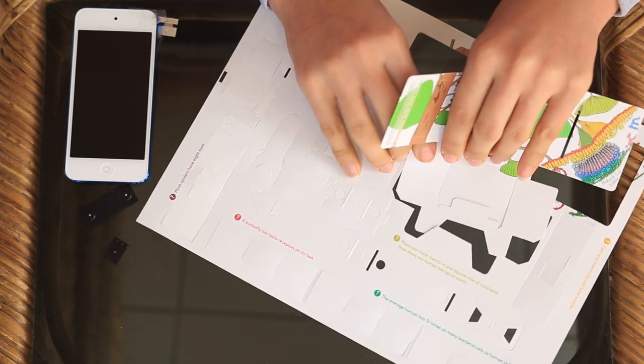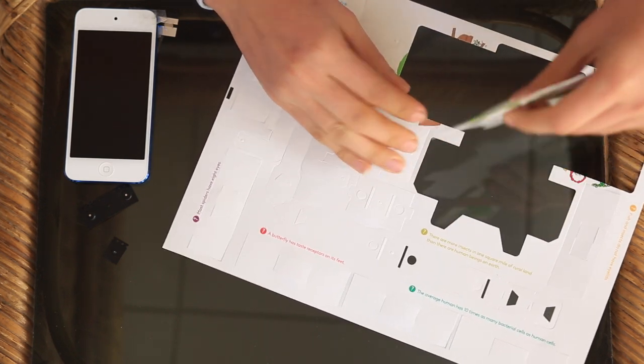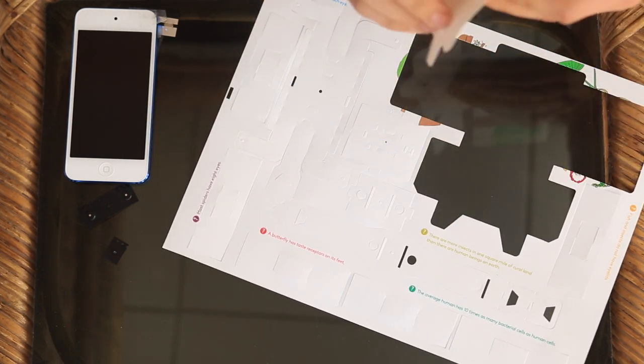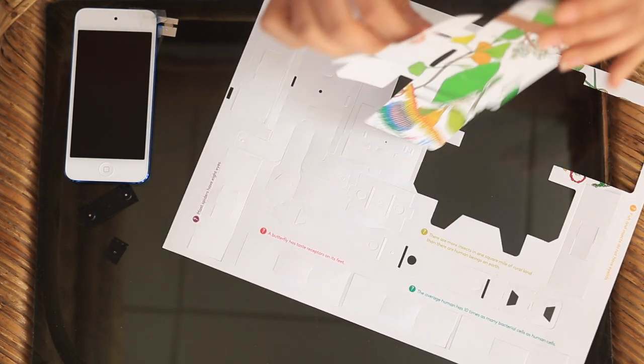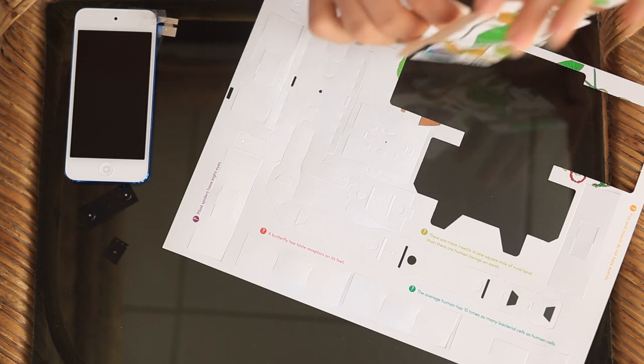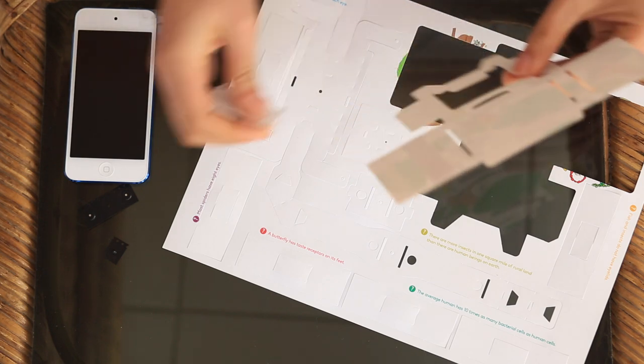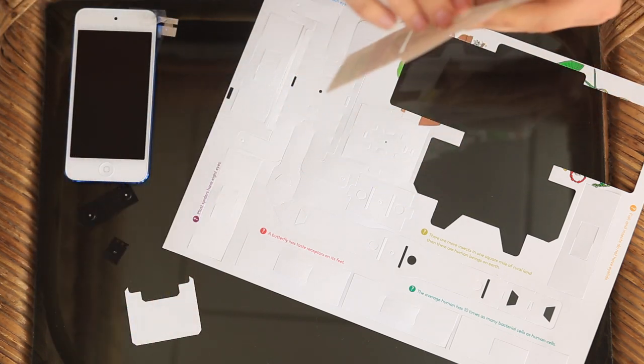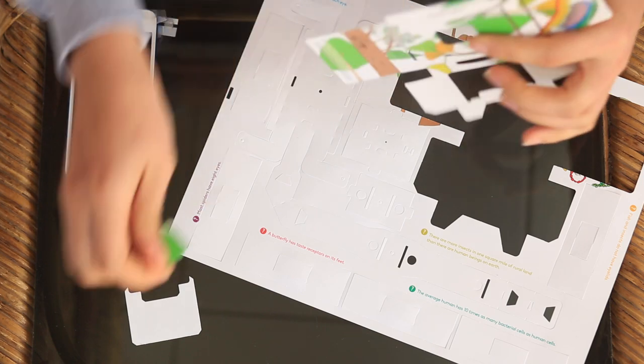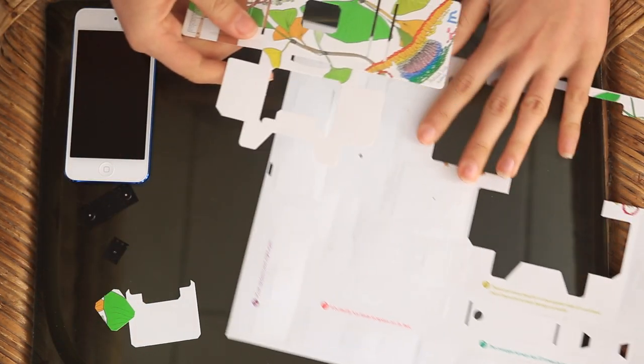So after you pop out all of the parts of it, you also remove this center part, and this center part. So then you're left with this piece.